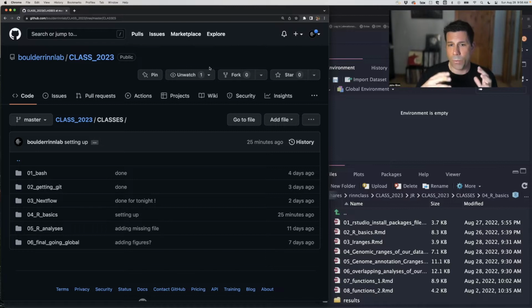And then we're going to move from finding those overlaps within the peaks of our ChIPseq data to genomic features, such as a promoter or a gene body or your favorite transposon, whatever you want. We will go into how to use genomic ranges on genomic annotations of all kinds. So in short, the first thing we're going to do is learn how you would take your peak file and compare it to another peak file and find the overlaps between 2 samples.